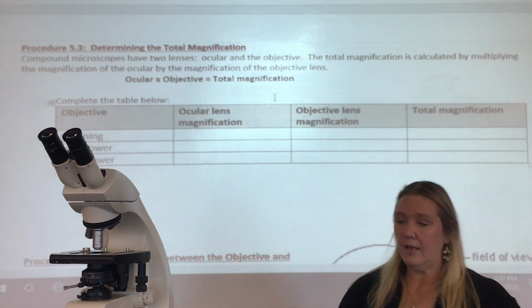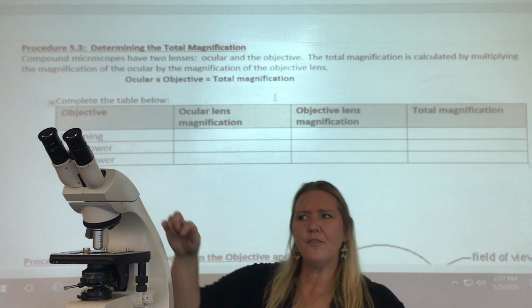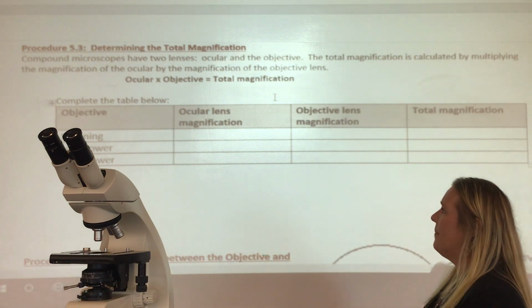All right, and right after this, I'll take the microscope down, okay? Because I'm going to go over the magnification of these. So right after this, I'll take the microscope out of the way, okay?